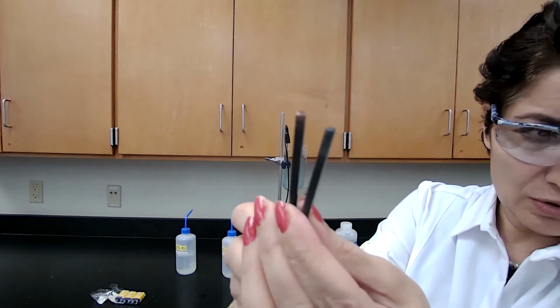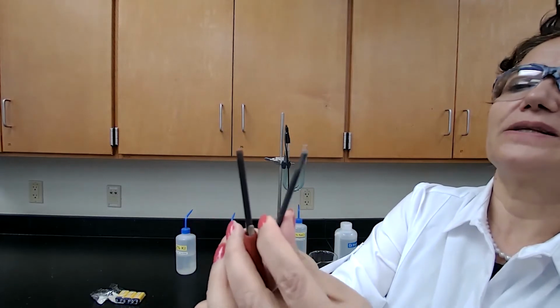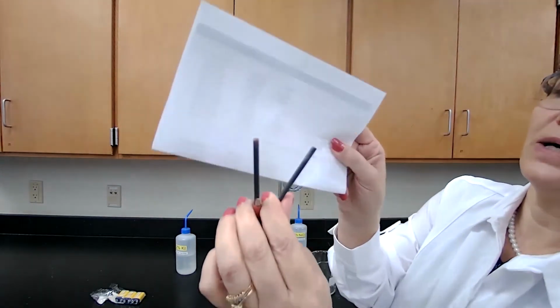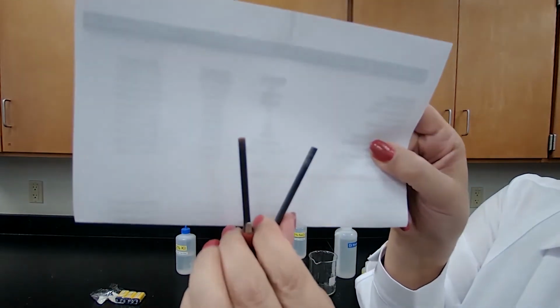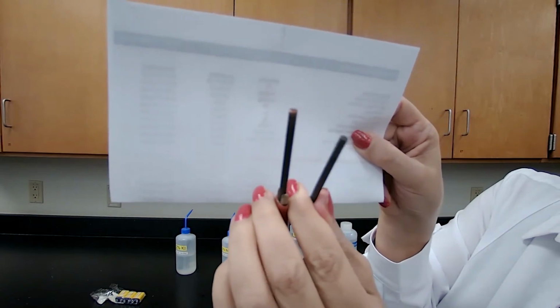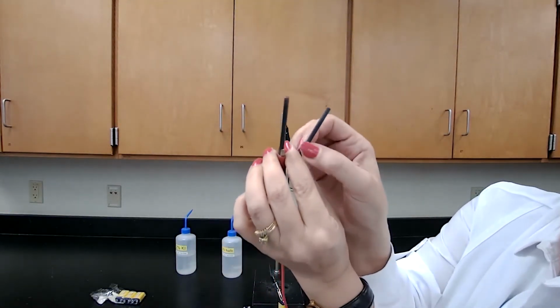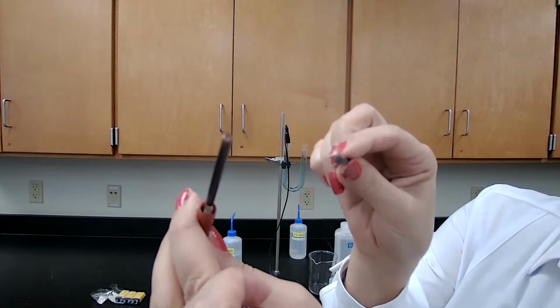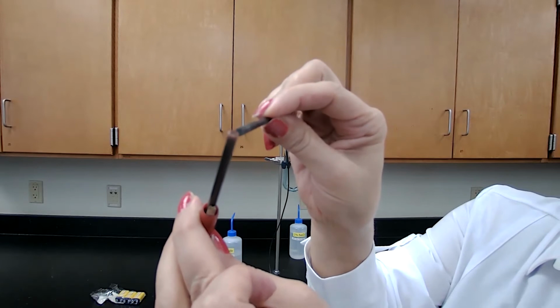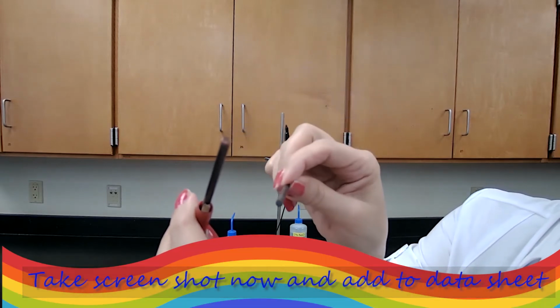I'm going to hold it to a white background for you, but it's very visible to me right here. So if you look at this color change, the red color now is obvious. This one is black, and this one has a pinkish or copper color on it.